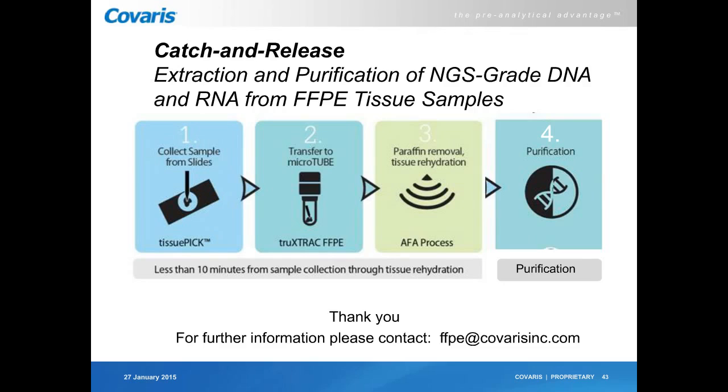Okay. What is the minimal tissue quantity workable with AFA? It's again the same question as working from FFPE tissue slides. It will depend on the tissue type. It will depend on the nuclei density. We had people working with very small quantities, and it also depends. There are many variables. The yields are very different depending on the type of tissue that you're starting with.